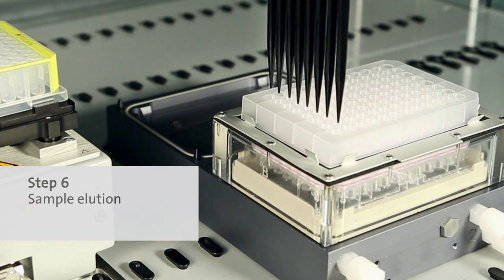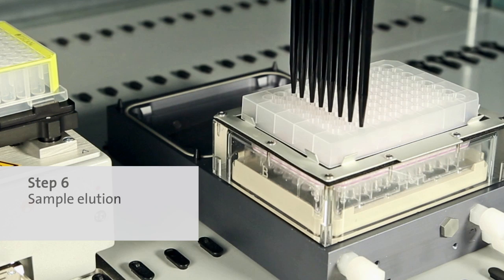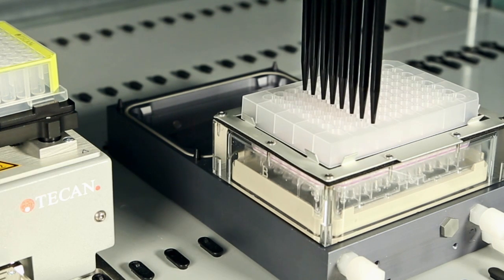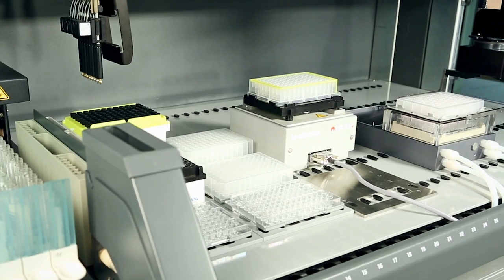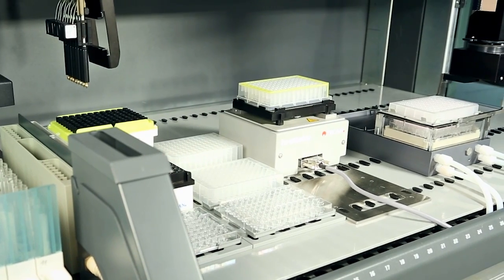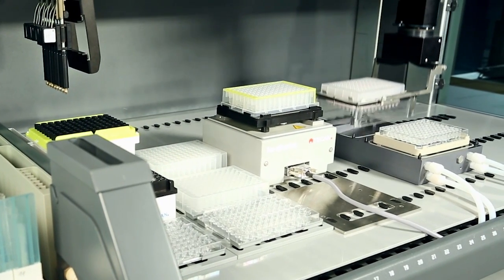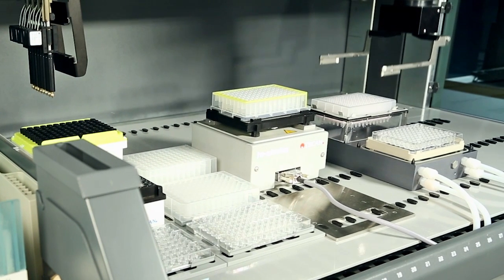The TVAC-S module allows pressure-controlled vacuum extraction from a variety of commercially available filter plates. Filter plates can be easily moved between waste and dilution positions on the TVAC-S using the robotic manipulator arm.